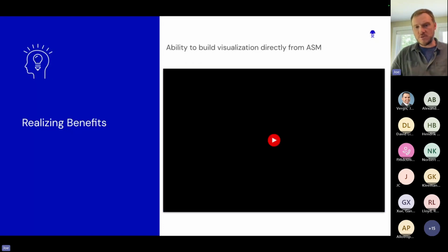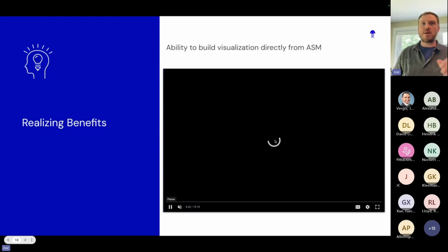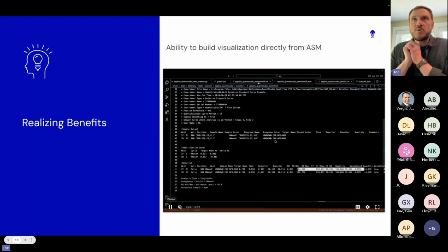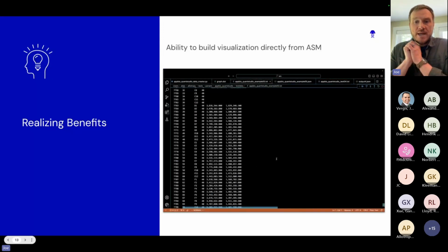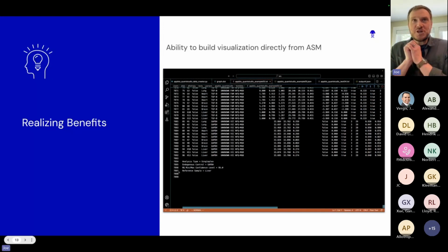this video is a utility that one of our colleagues built to represent some of the elements in this. What we're showing here is real qPCR data, and so you can see what this looks like.